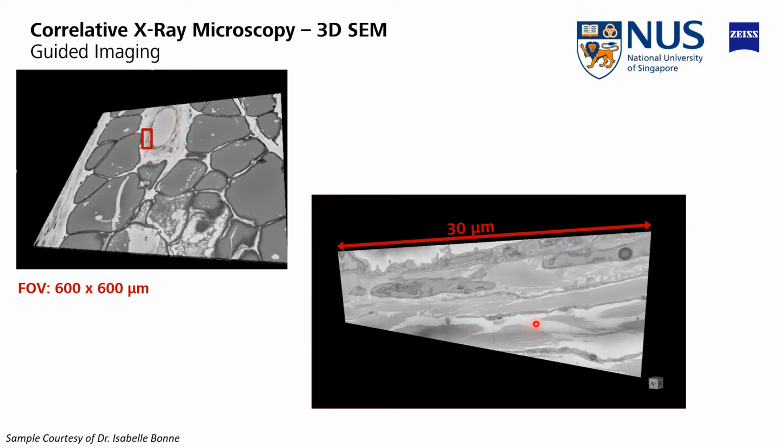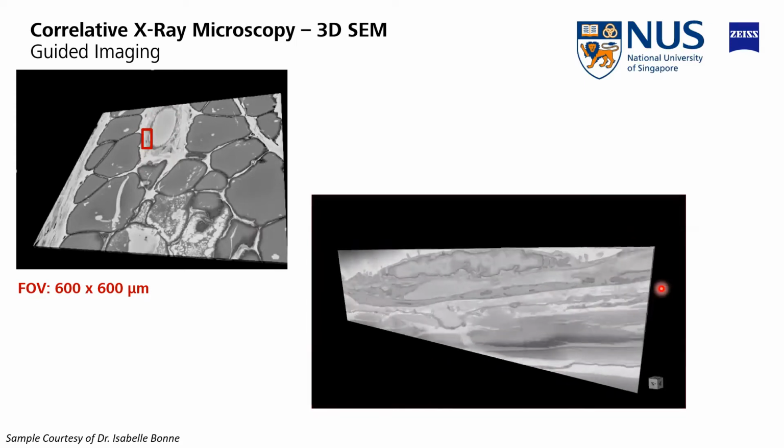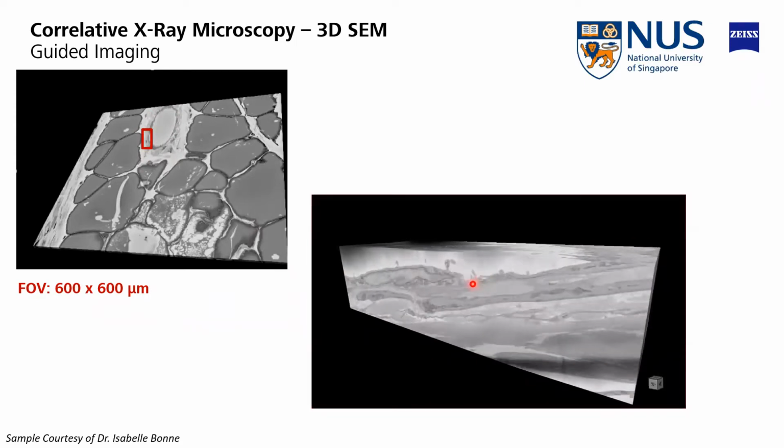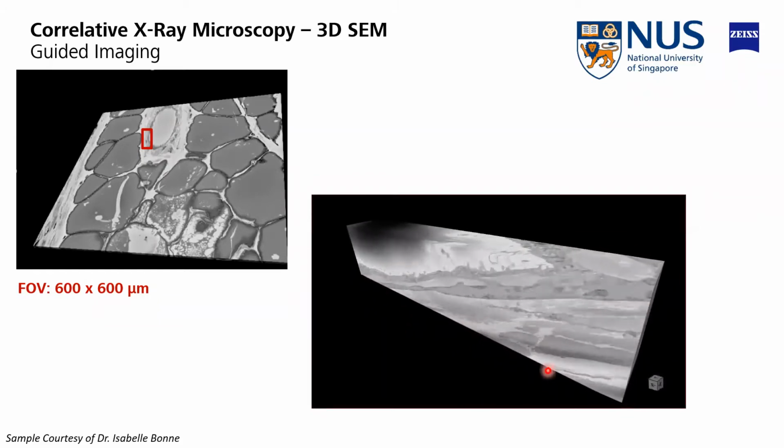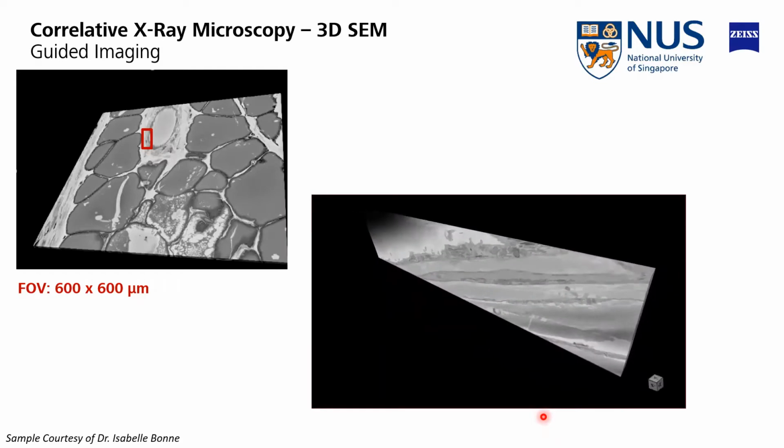And what the researcher here was very interested in is to see the collagen fibers that are running all around that lymphatic vessel. Right? There's an endothelium, there's some smooth muscle cells, and then eventually you see all those fibers running through the data set. And this is what they were really interested in understanding: how some of the diseases actually affect this lymphatic collagen fiber network, and cause some of those lymphatic vessels to be weaker than in a healthy state.